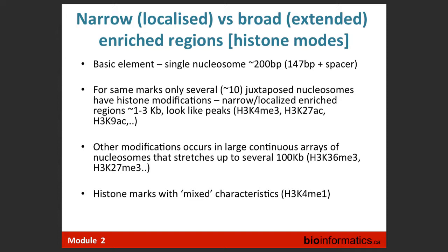Now, there are tools which visually analyze those peaks. You can do it. The question is, when you have 100,000 enhancers, it will be a little bit hard to do it for each and all of them. So you have to train your system somehow. You train on some locations maybe, and then you try to analyze the rest computationally. Someone developed a tool that does exactly that. You look at a few regions, and based on that, optimize parameters to the best. But no matter what, there are some parameters to tune with all these peak callers.